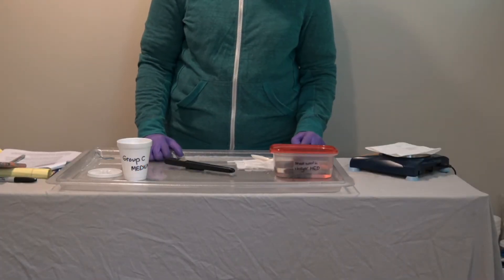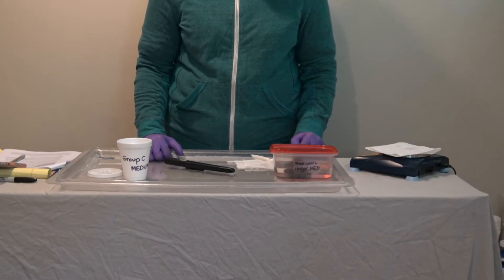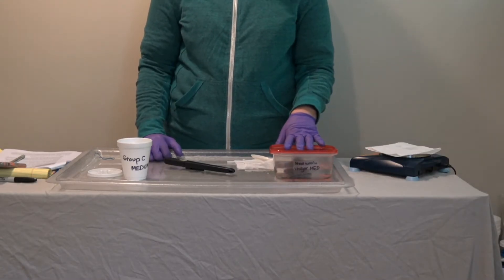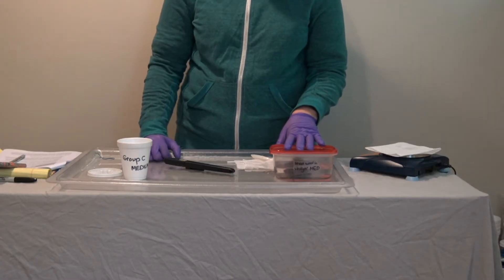In this lesson, Group C will be measuring the temperature increase caused by exposure of steel wool that's been cleaned in vinegar to oxygen in the air.